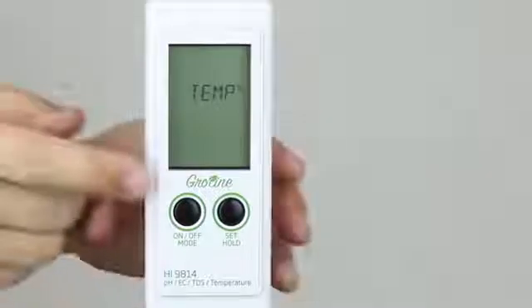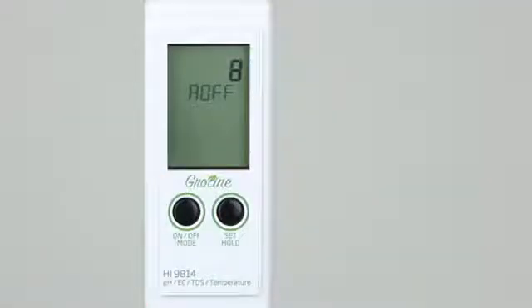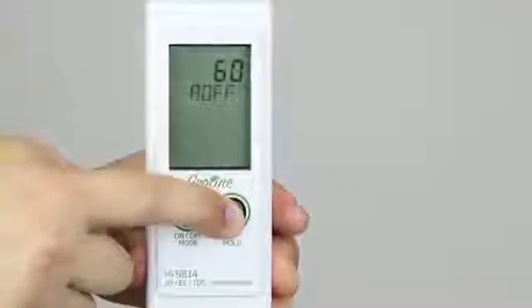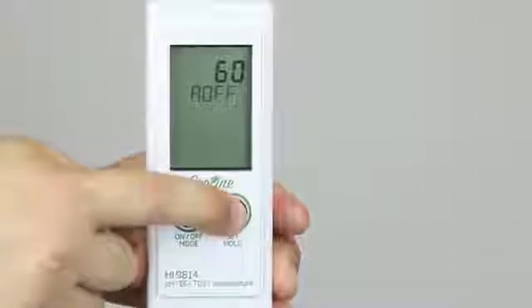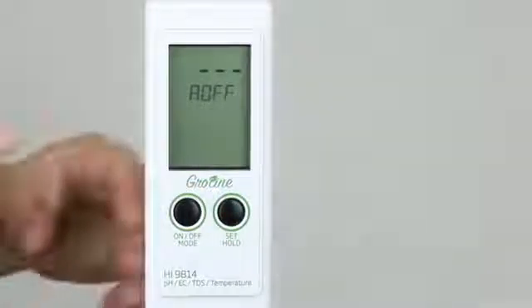Press the mode button again to set the automatic shutoff time. The default setting is eight minutes. Press set to change it to 60 minutes or press set again to disable auto off. Pressing the mode button again exits back to measurement mode.